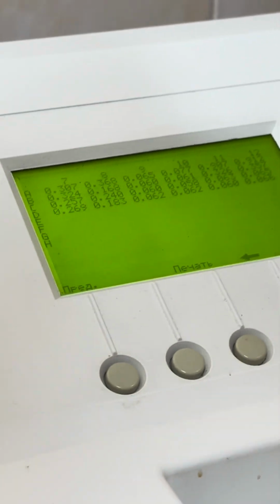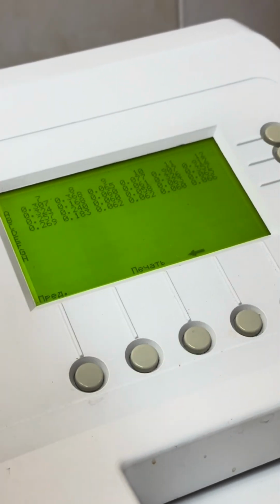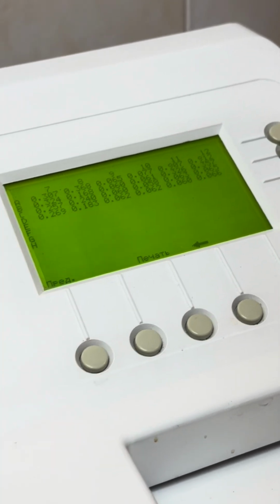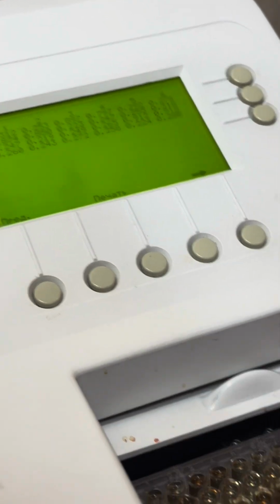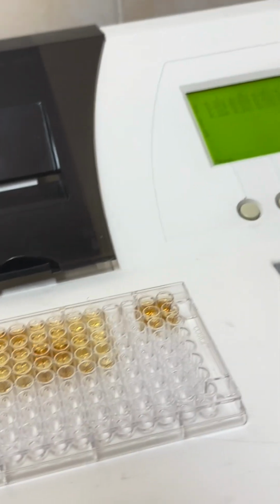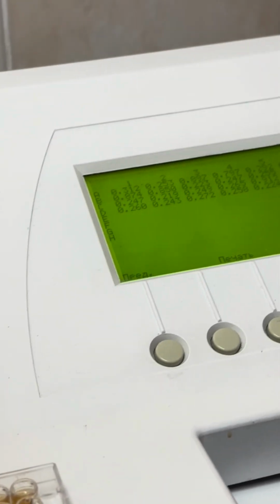Okay, look. Positive controls A11, A12: 0.907 and 0.912. Negative controls B11, B12: 0.326 and 0.357. All the rest, looking from the left side. Positive wells: A3, 0.897 and A4, 0.797.